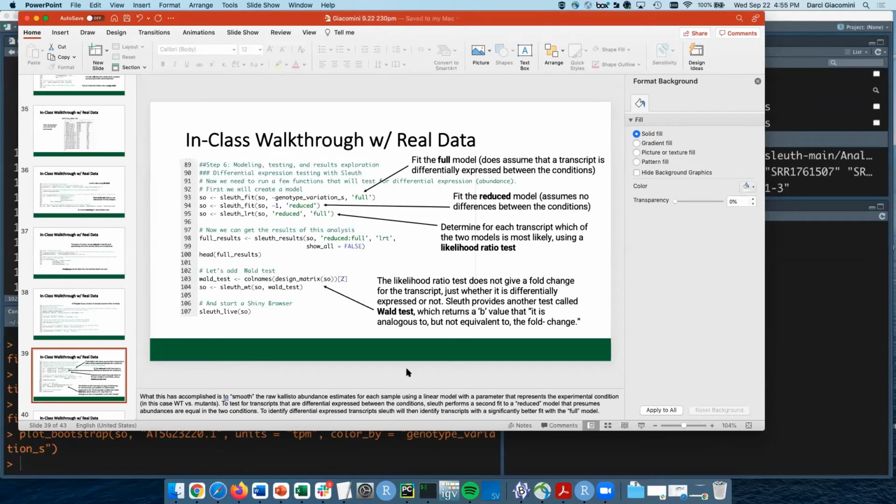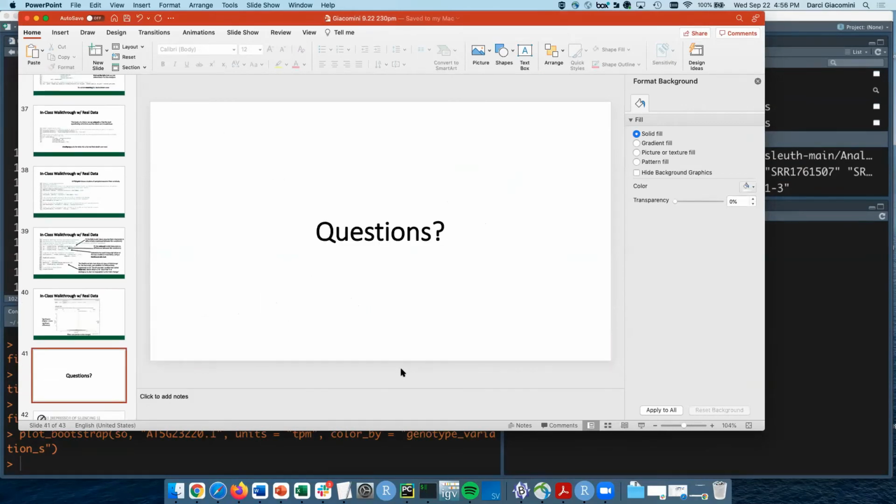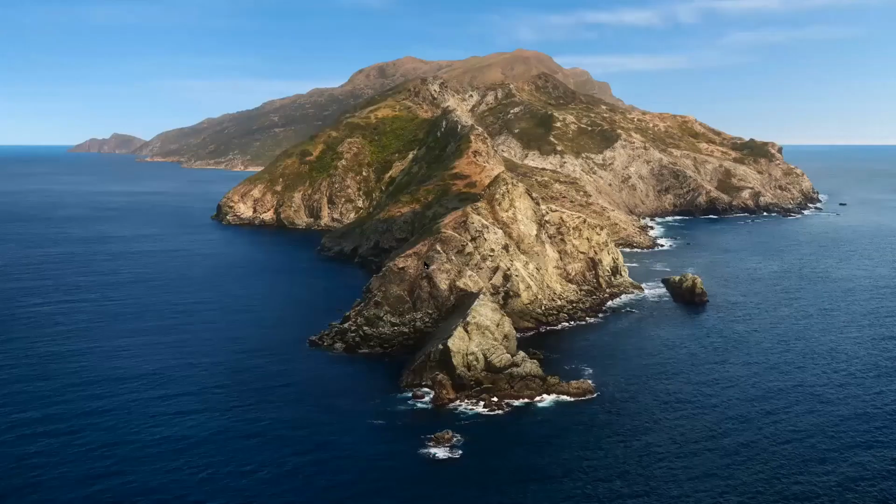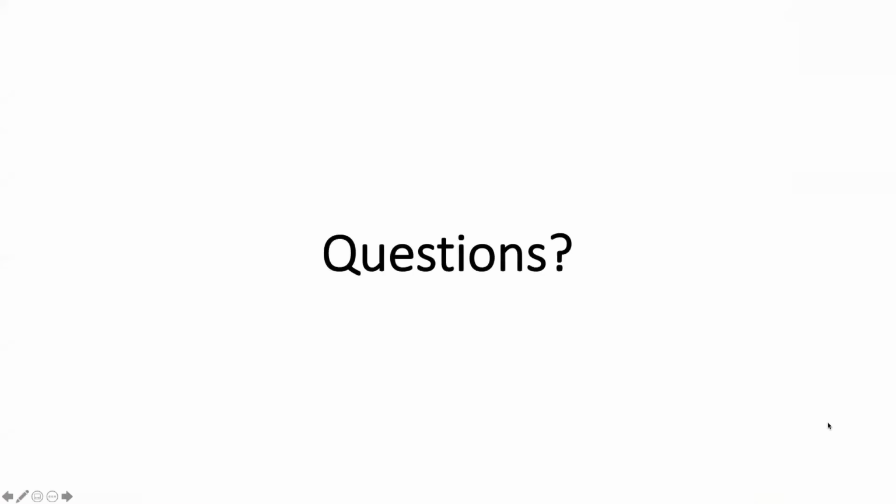Okay, are there any questions from that part? Nope. So my question is, how was your data normalized? Normalized, yes.